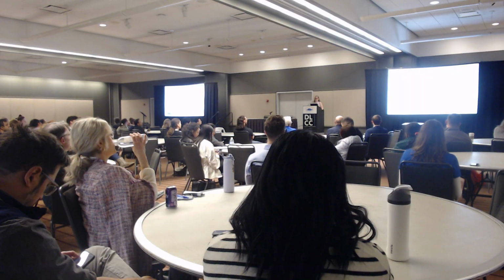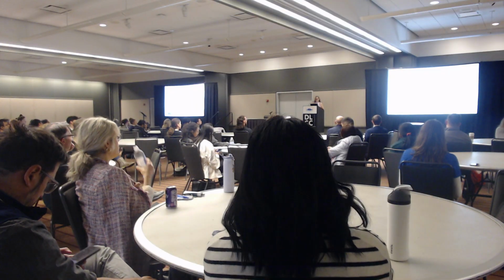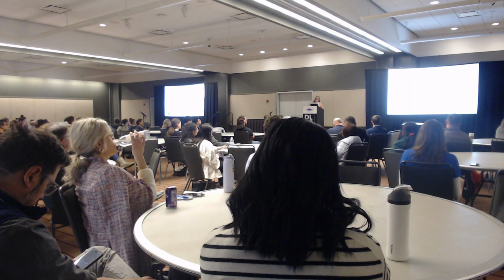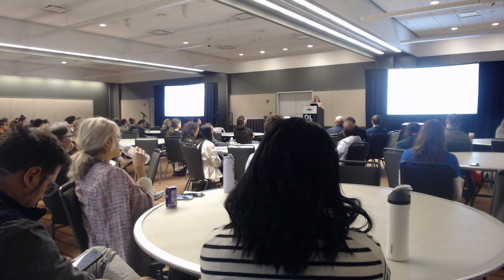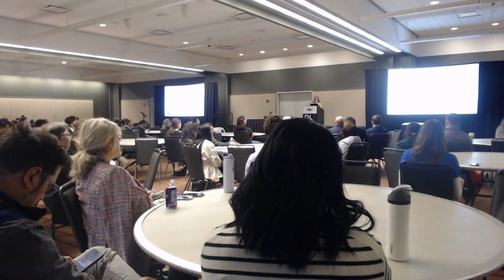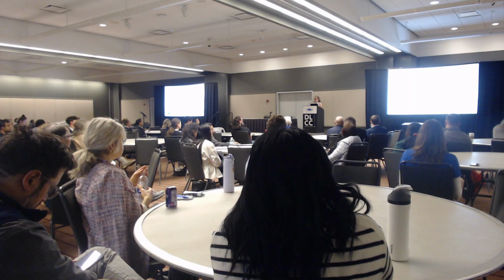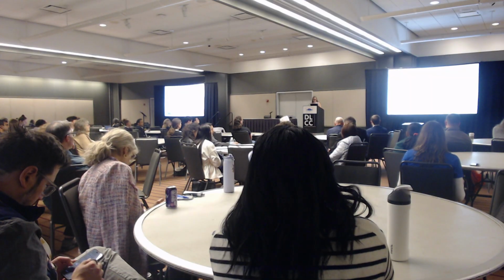What we're looking at here now are those regions where, in HPV plus, if it's red, they are predominantly significantly methylated, and then they go down the negative here. So if they're positive, they're highly methylated in that condition. If it goes below 0, then there's a shift towards the other mark. So we're now able to look at shifts between conditions where in one group it was predominantly methylated or hydroxymethylated, and in the other group it's completely different. That can also give insight into shifts in pathways and other questions that were very challenging to address before.